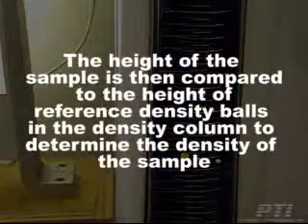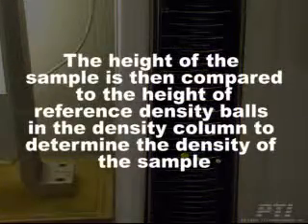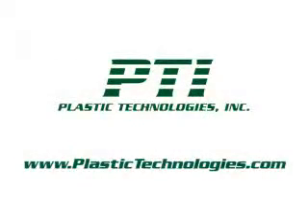The test is shown here at five times normal speed. The sample will come to rest at a height dependent on its density. The height of the sample is then compared to the heights of reference density balls in the density column to determine the density of the sample.